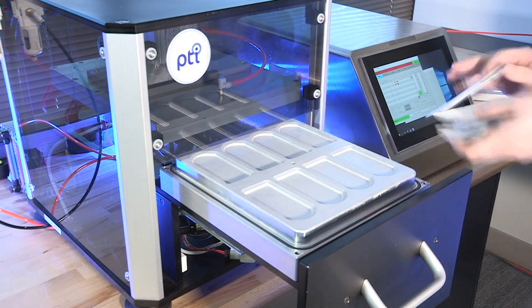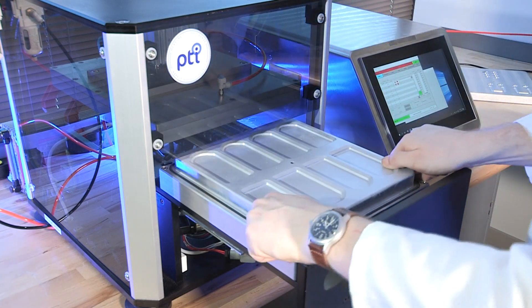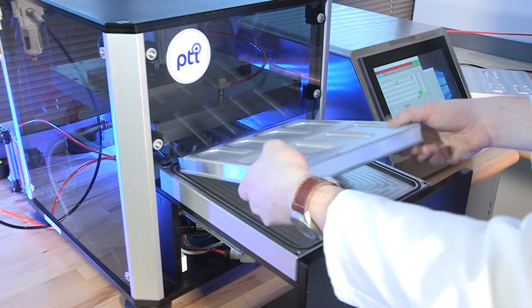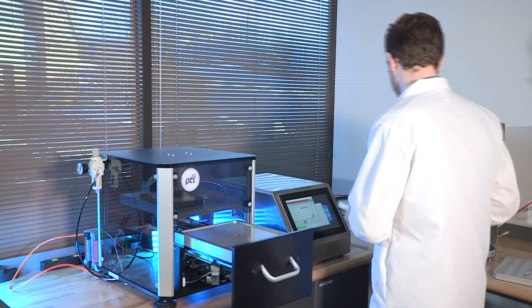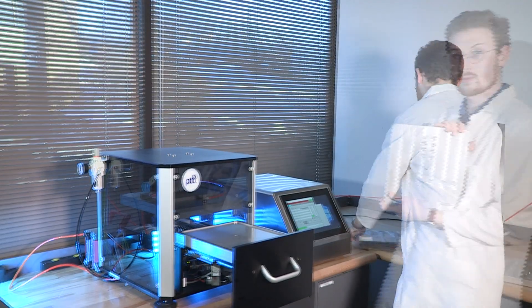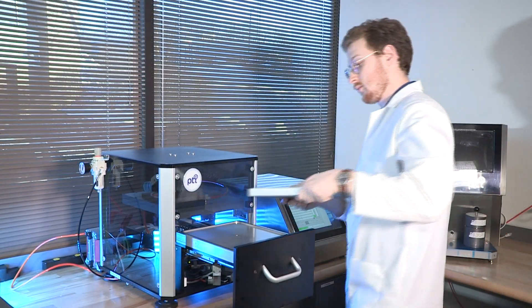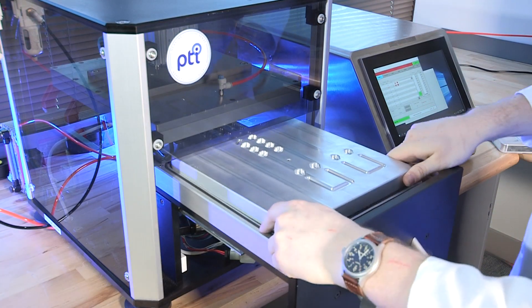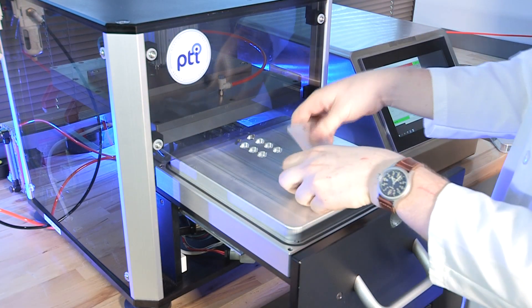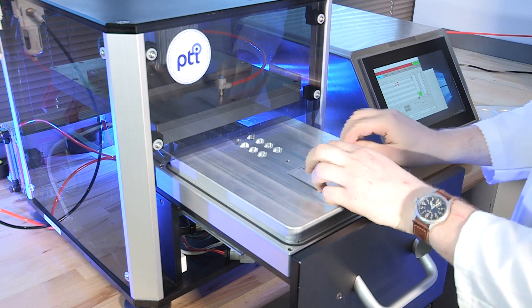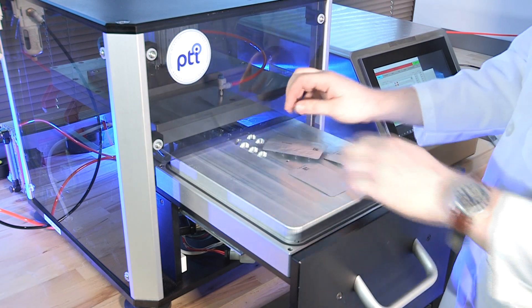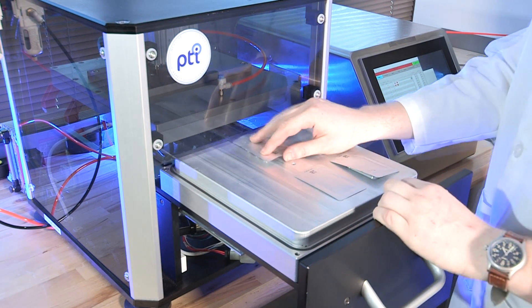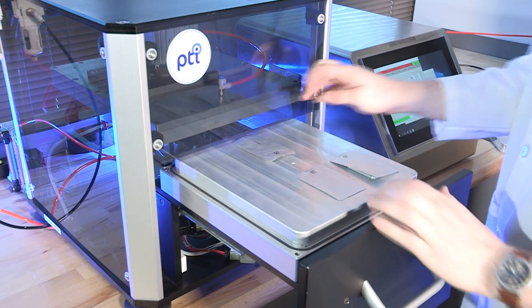This system utilizes the Force Decay test method to specifically test very low headspace package formats such as sachets, stick packs, blister cards, and several other low headspace application types.